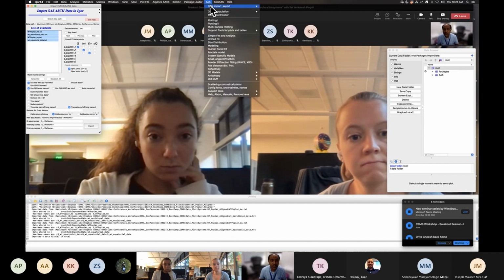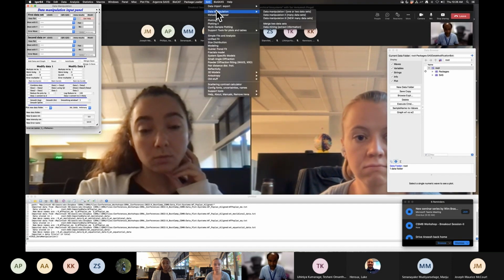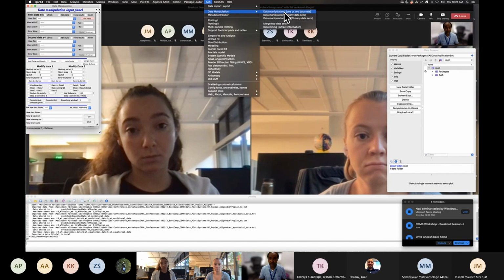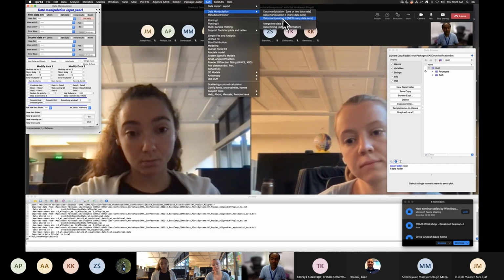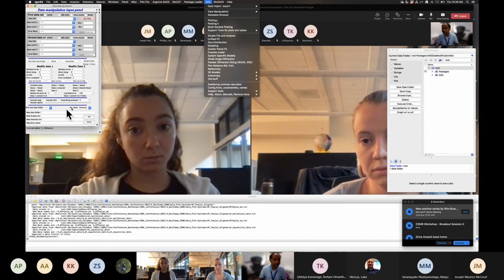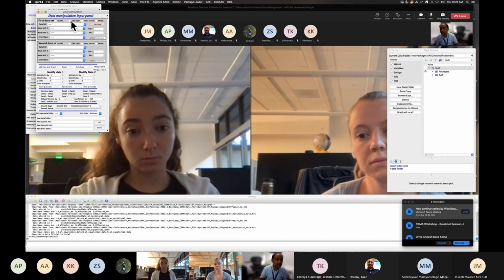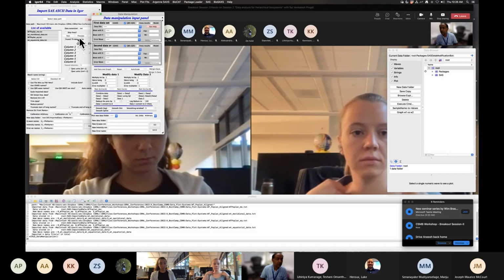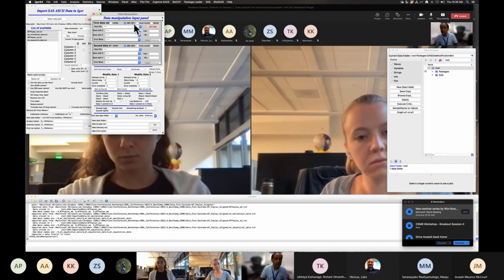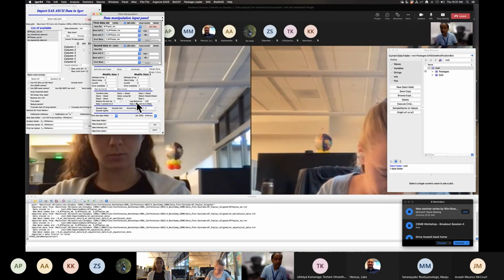The next step is once it's imported, we need to go to, I'm sorry, I was a bit fast there, manipulation, and that's for one or two data sets, data manipulation one. These things I haven't needed to use, but probably you could explore those if needed. Jan keeps putting in newer and newer features, and unless you need it, you don't get to that. The next thing is these are all QRS columns. That's why you need to click on that, and then you choose some curve, plot it.